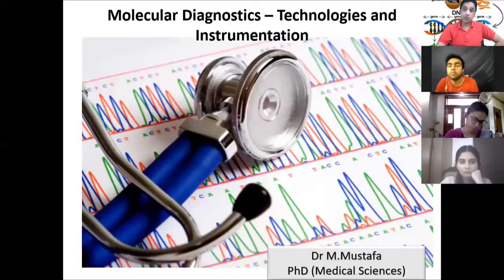So let me start formally, because I have created those slides in the perspective of molecular diagnostics, because it is one of the very famous medical biotechnology based techniques in which we can use PCR reaction for diagnostic purposes.